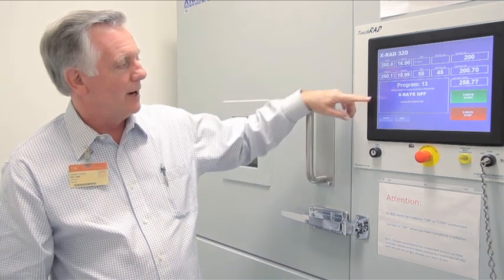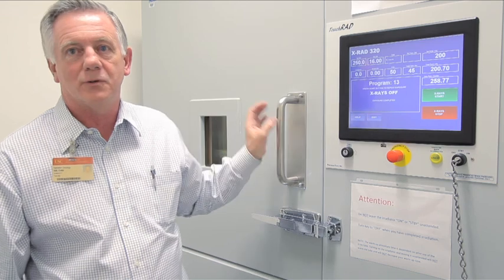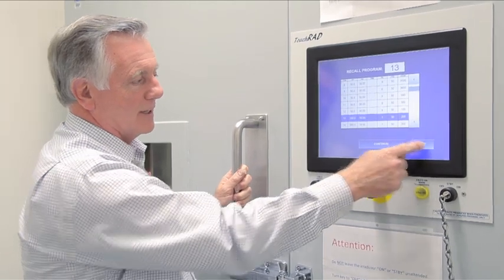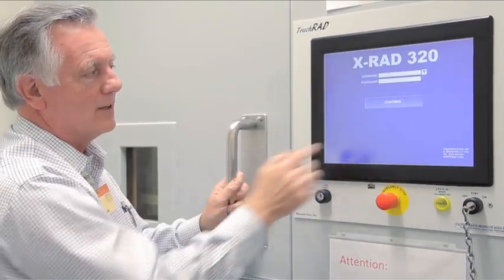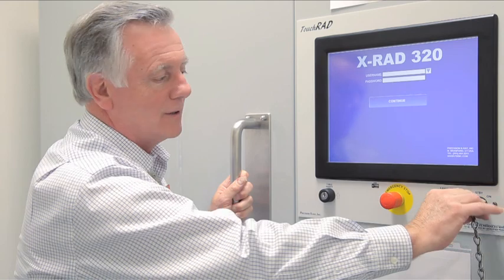You can see it now shows X-rays off and the light has gone off. Your dose is very close to the dose you asked for. When you're finished, press exit, then press exit again. If you're finished with everything, press exit once more. That brings you back to the first phase, and at that point you can actually turn off the irradiator.